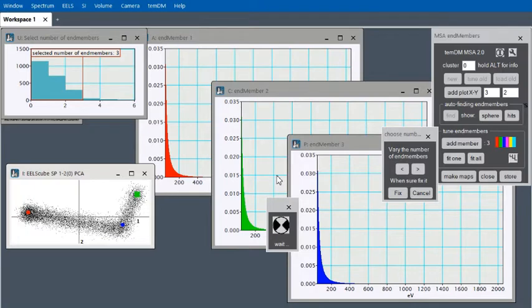You see that these end members are very close to what we found manually, but actually the procedure is still not finished. You see that this waiting icon is still working. The system outputs just what it considers to be the most probable end members, but you have to decide further yourself. Please note this graph in the upper left corner. This is some kind of probability of existing end members. And the most probable is just this, 3.